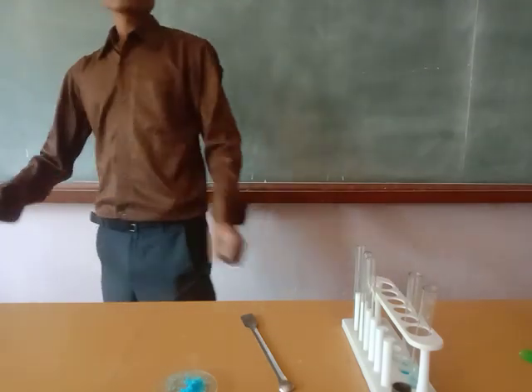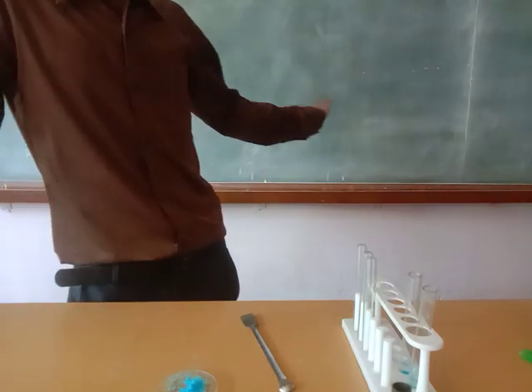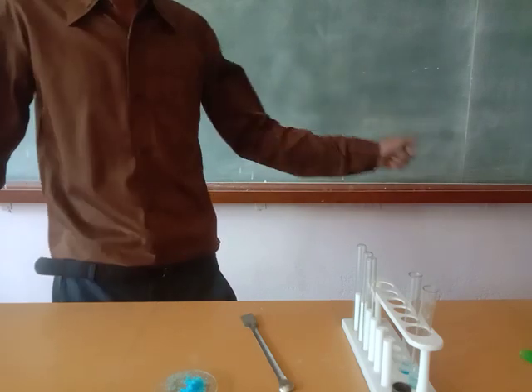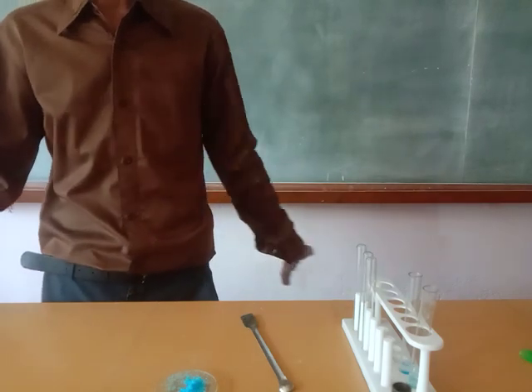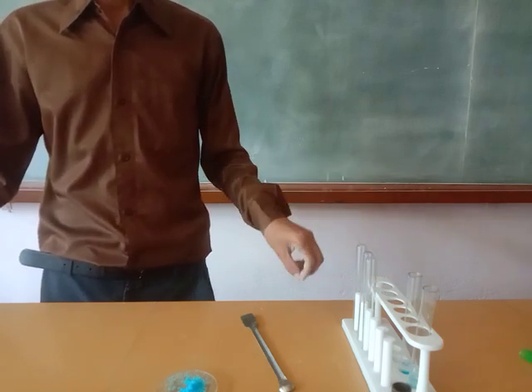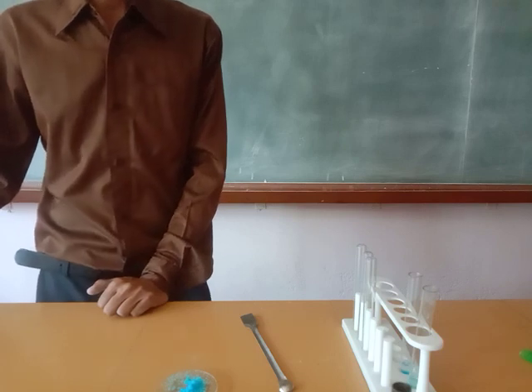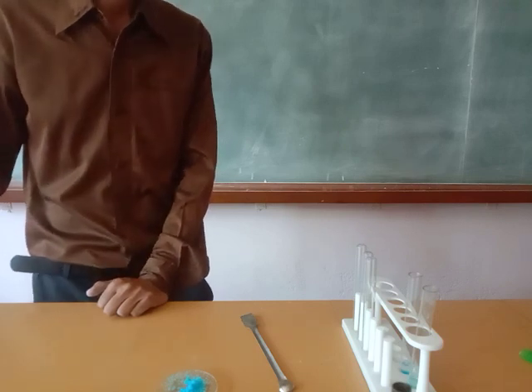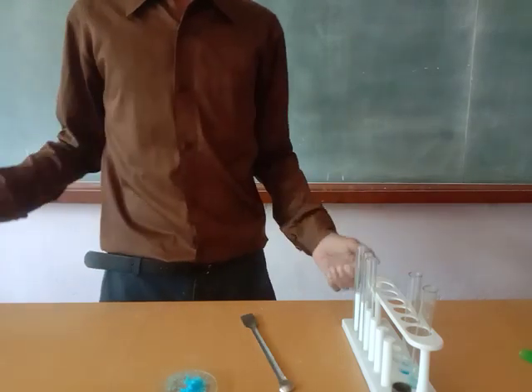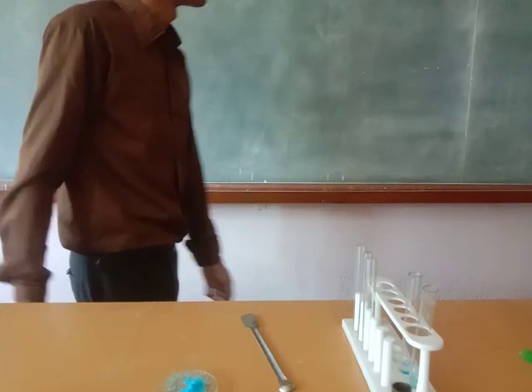So here we have noticed that in dilute sulfuric acid test and also in concentrated sulfuric acid test there is no observation. If you observe nothing in both the cases, then it indicates the independent radical, and sulfate ion is called independent radical. So now we will do wet test or confirmatory test for sulfate radical.